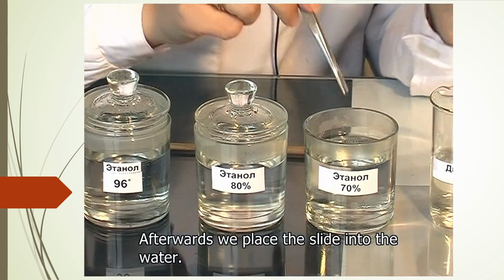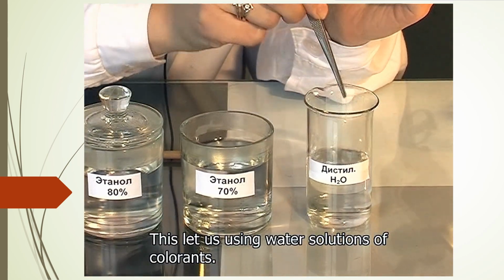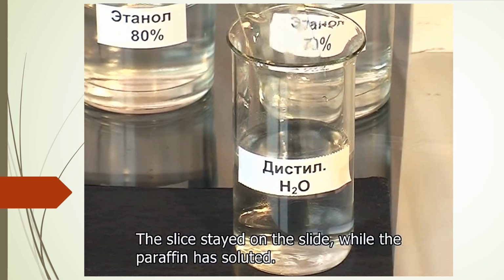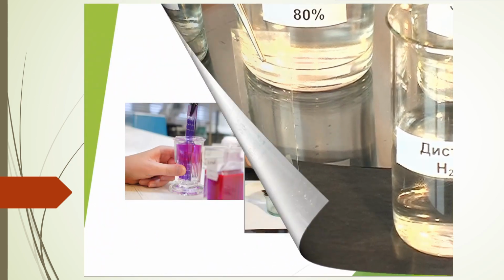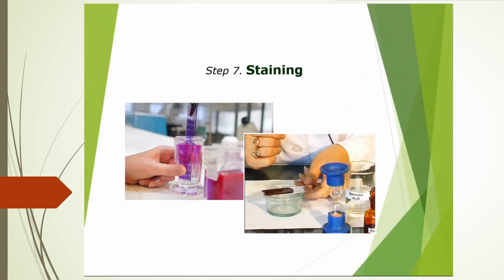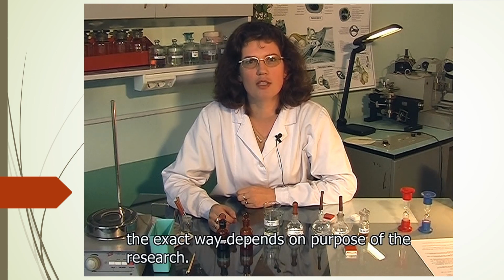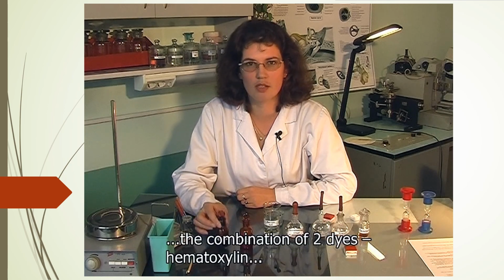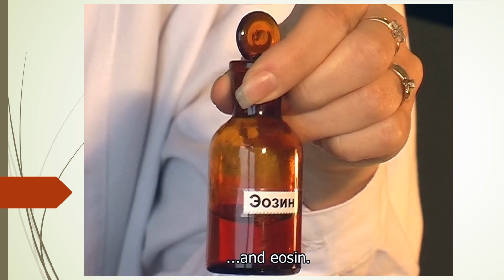Afterwards we place the slide into the water. This lets us use water solutions of colorants. The slice stayed on the slide, while the paraffin has dissolved. There are a lot of ways of staining. The exact way depends on the purpose of the research. The most widely spread way is using the combination of 2 dyes, hematoxylin and eosin.